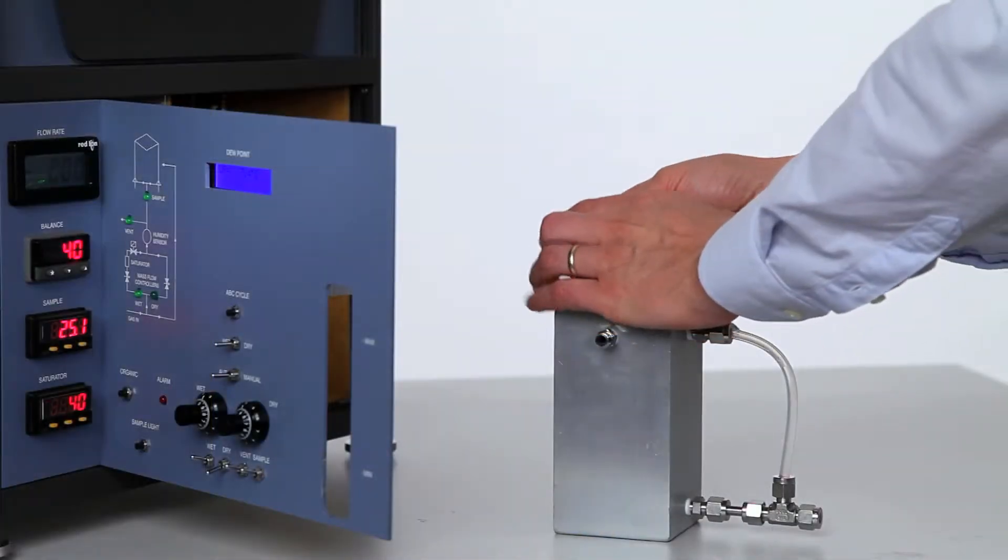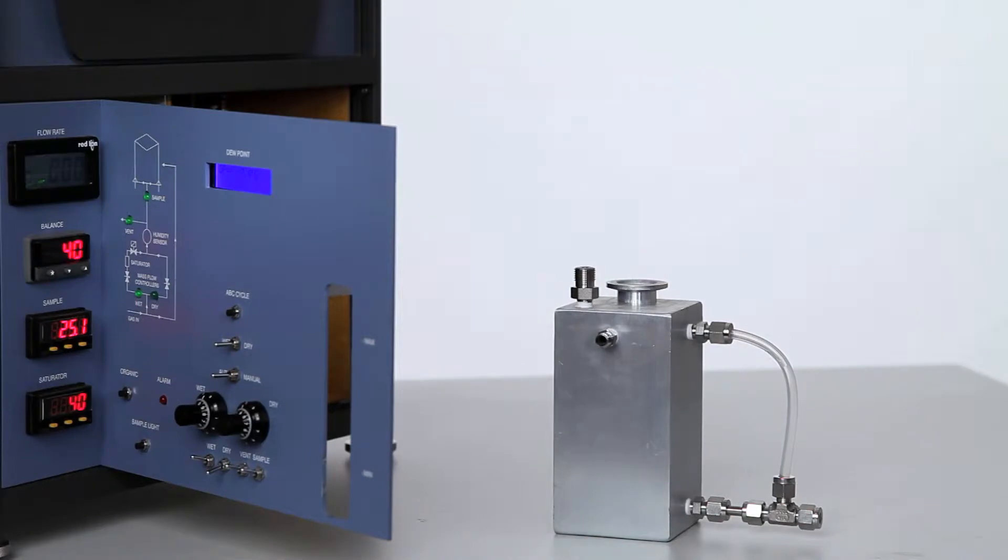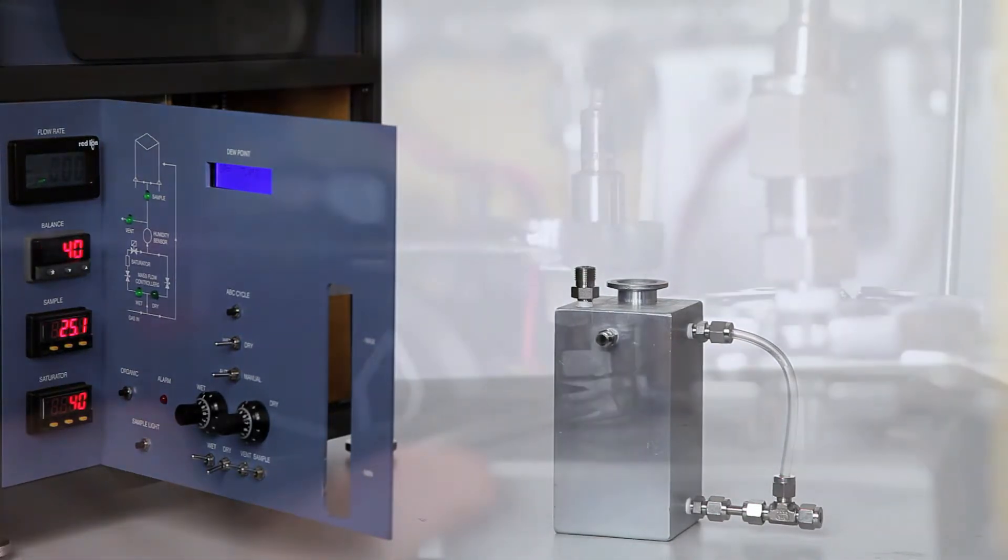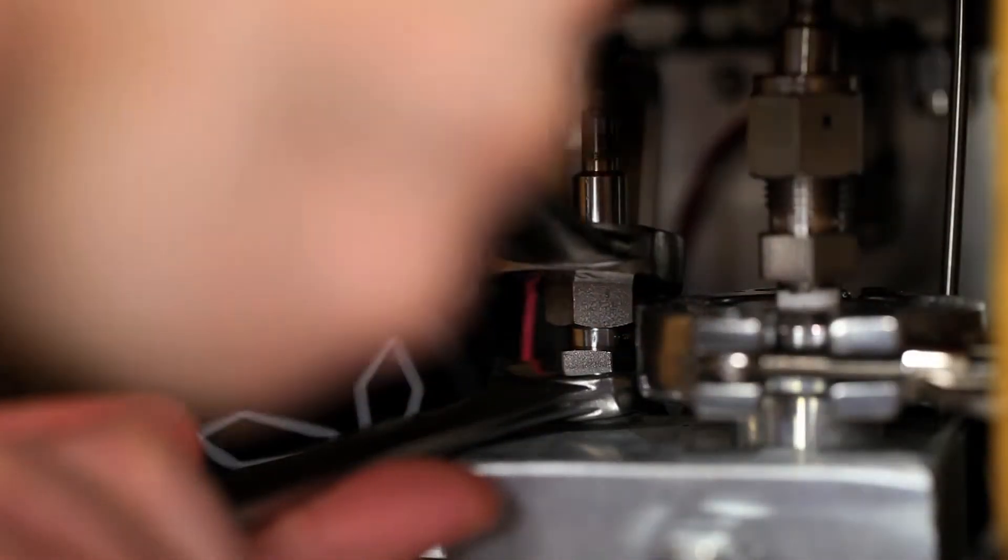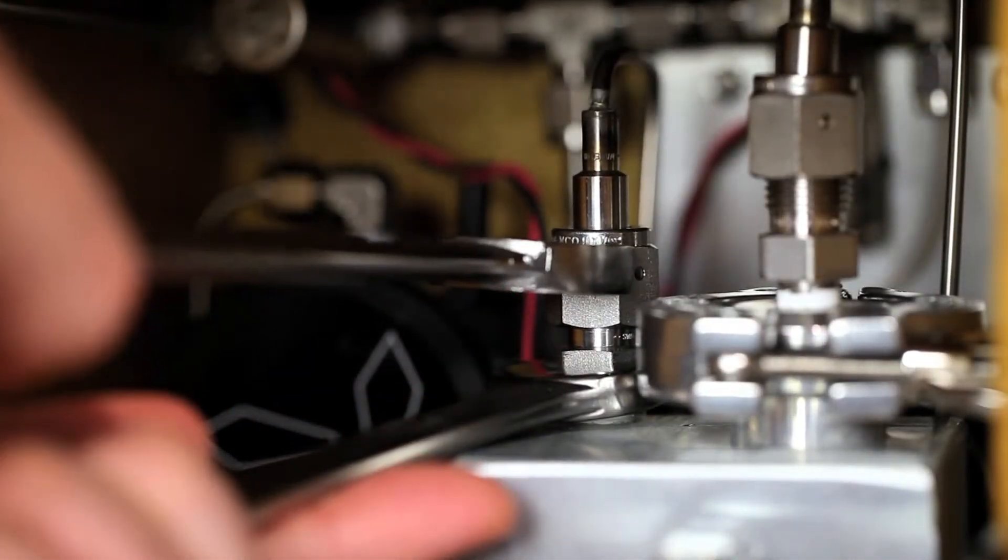Fill the saturator to the level shown on the instrument marked MAX with distilled water. Install the saturator and reconnect VCO fittings.